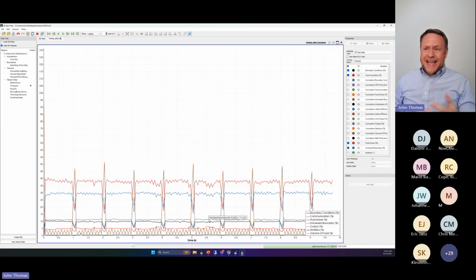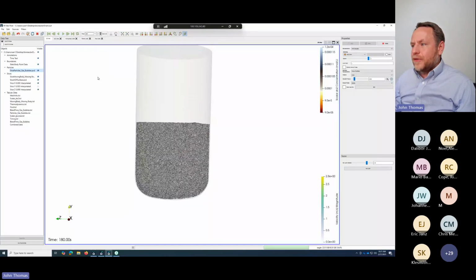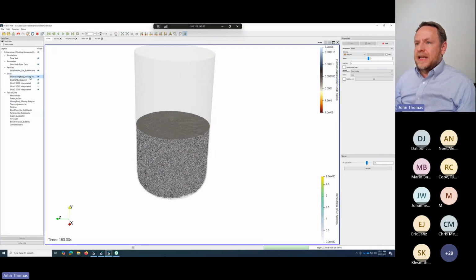Quite frankly, I think it's worth it because it's not a sloshing system. There's not a big vortex. I might get a little dimple here, but for example, and this is forecasting what we're going to see as we go through this.